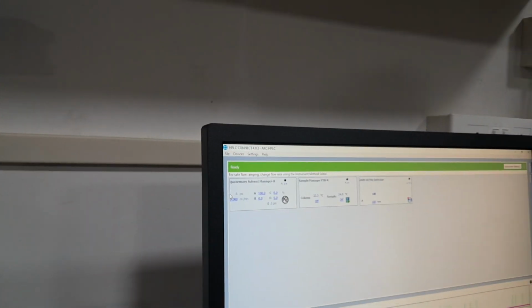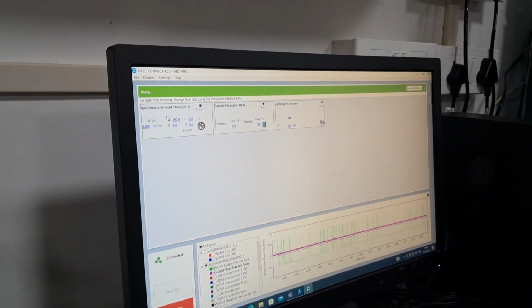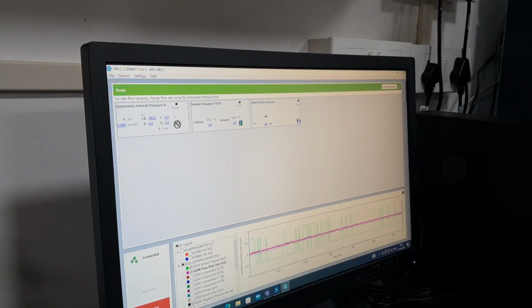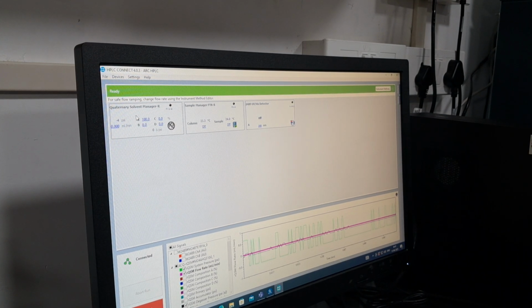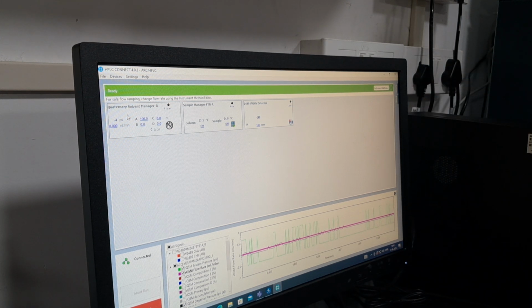So that we have kept it. Now we'll go for flushing the instrument, the very first thing. If the earlier analysis or the instrument has been shut down for a longer time and you want to flush the instrument, use the very first solvent. I will suggest water. The plain water, the Milli-Q water, you can keep in the mobile phase bottles, and you can start the priming for the instrument.